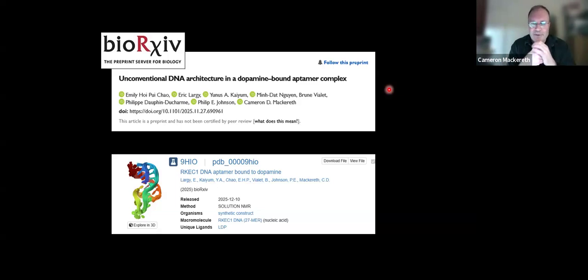tried to come up with a quick estimate for how folded a DNA is. So maybe you could take an initial spectrum like I did. The way you do a lot of NMR, you calculate the volume under the peak. It tells you how many hydrogens are there. And because these are exchangeable hydrogens, they can be 0 up to 100%.